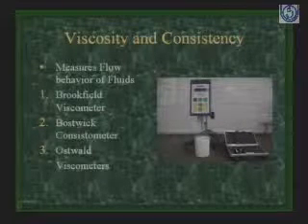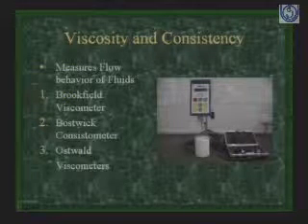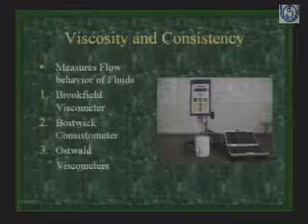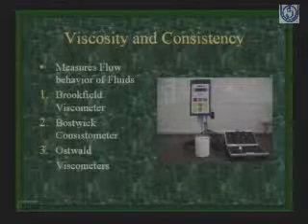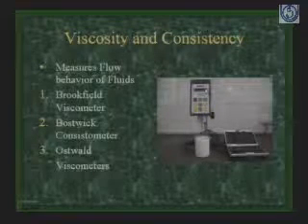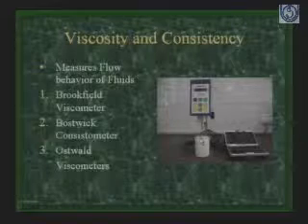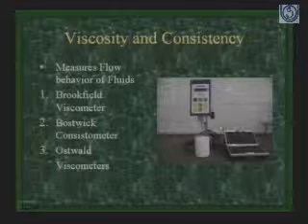And you see here in this cabinet there are different spindles, 1, 2, 3, 4, 5, 6, 7, and the spindle can be changed from this nut. According to the presumed viscosity of a product, we can put on a spindle of a suitable size, then we set the speed, and also the temperature can be set, and viscosity can be measured. So from low viscosity to higher viscosity products can be measured here.